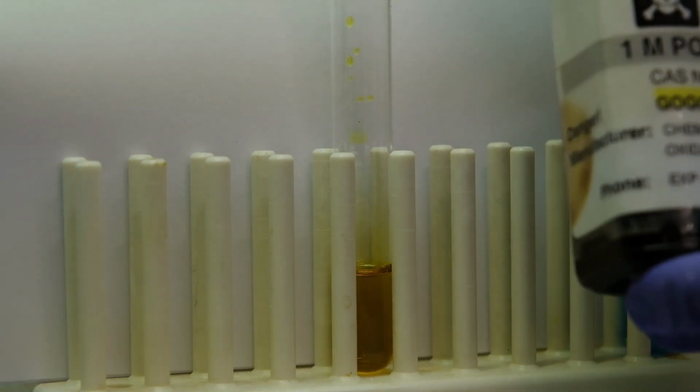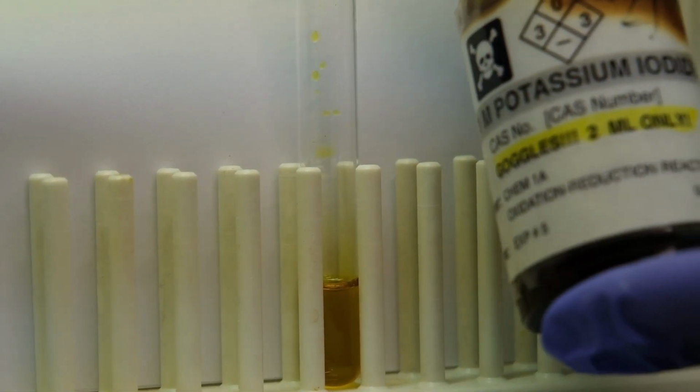Now I'm going to add approximately 2 milliliters of the 1 molar potassium iodide.